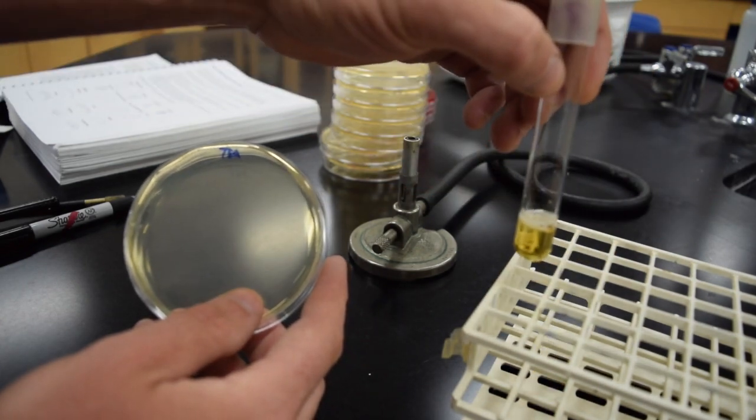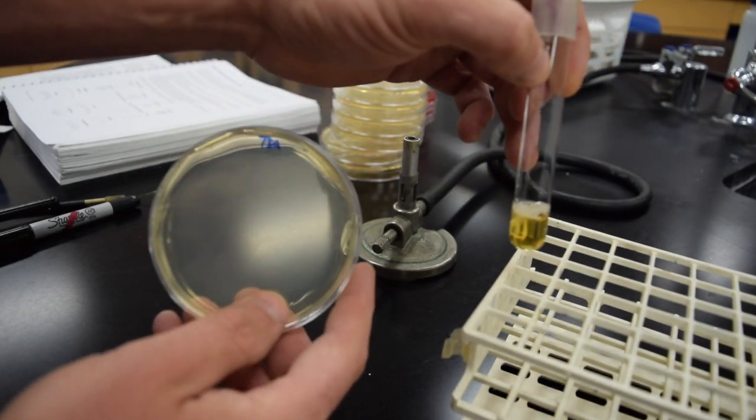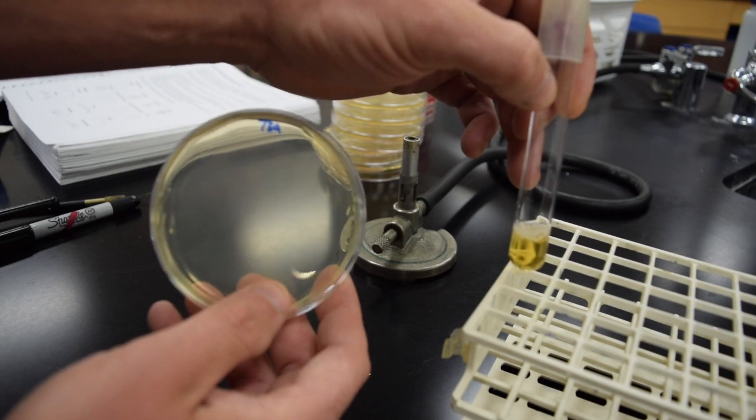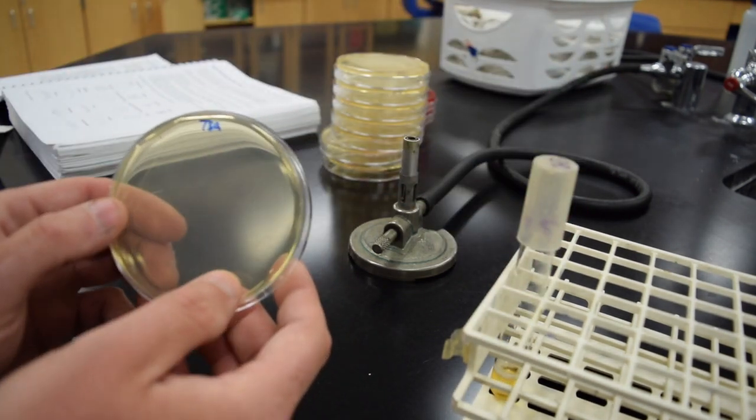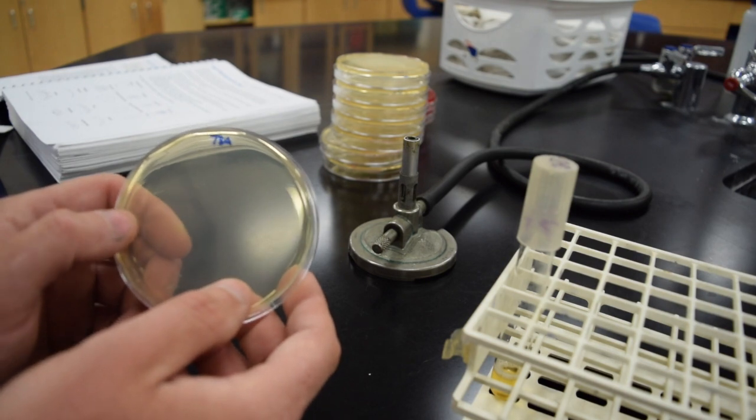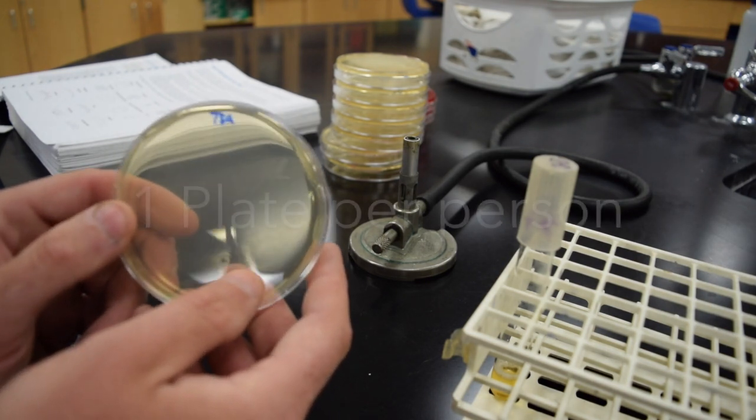In contrast, this is tryptone soy broth. These are basically the same media except the broth does not have the agar in it. So for Lab 1.1, the hand-washing activity, every student will use a TSA plate.